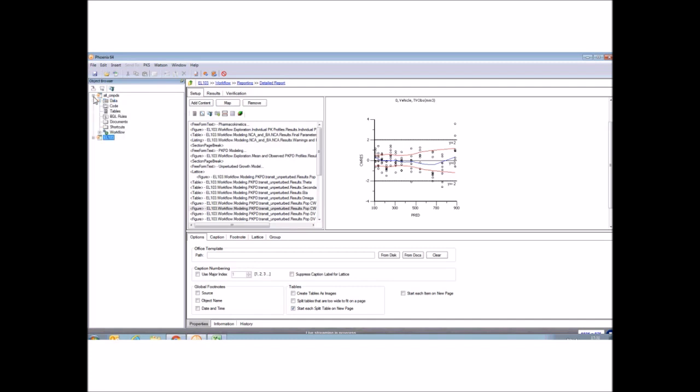But what I said in the beginning, you can also do a workflow where you can compare across compounds, like what we've seen here. One way to do that is just to import all the individual compound workflows into a single project, like I did here.